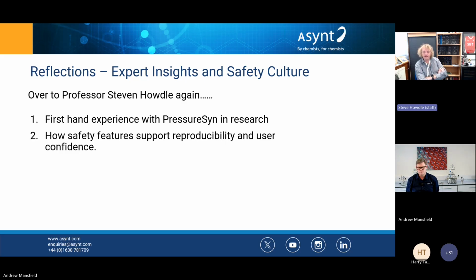We designed it for high pressure operations. And of course, we mainly use it for processing polymers and synthesizing polymers, but there's no reason why the same apparatus can't be used for other types of chemical reaction processing, as you mentioned yourself, Andrew. So I'd be very happy to take some questions if there are any individuals who have any particular questions.